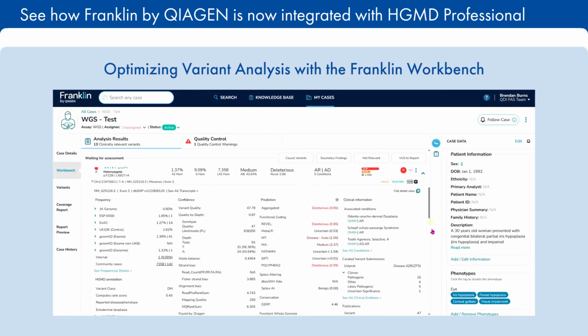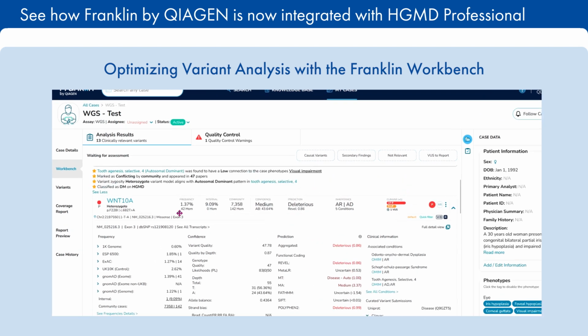You will also see information on frequency, zygosity, population data, mode of inheritance, confidence metrics, and information from ClinVar. These variant tiles provide a ranked actionable list that is clear, visual, and optimized for rapid interpretation. You can then select the variant and decide if it has clinical relevance in your case, as we show here.